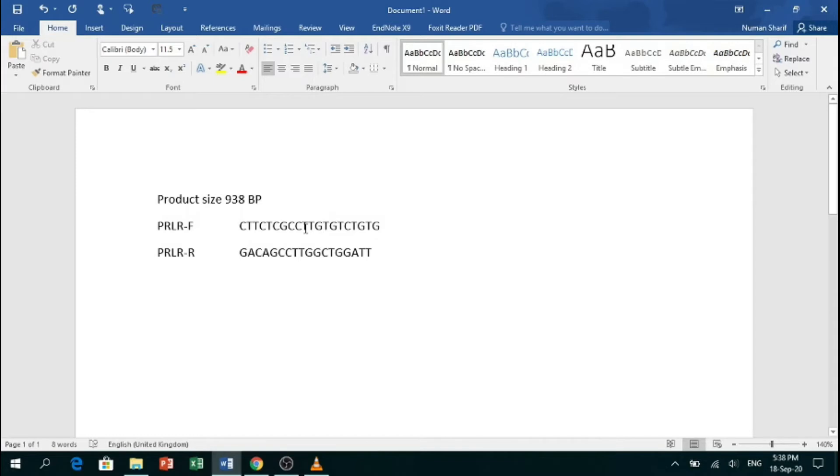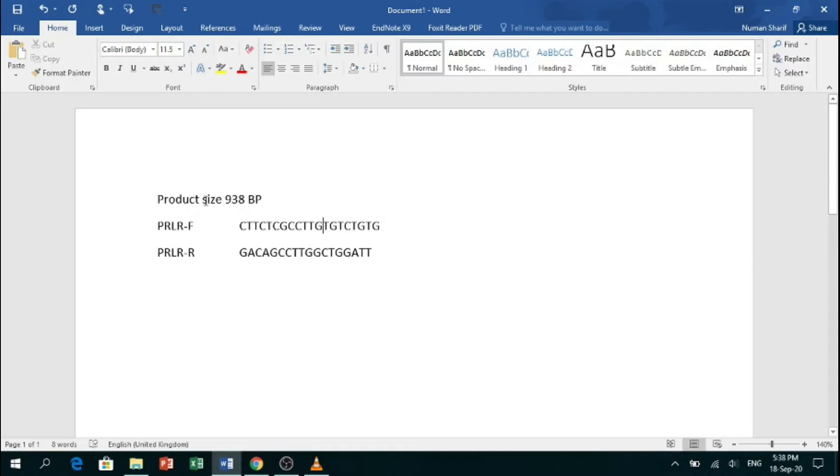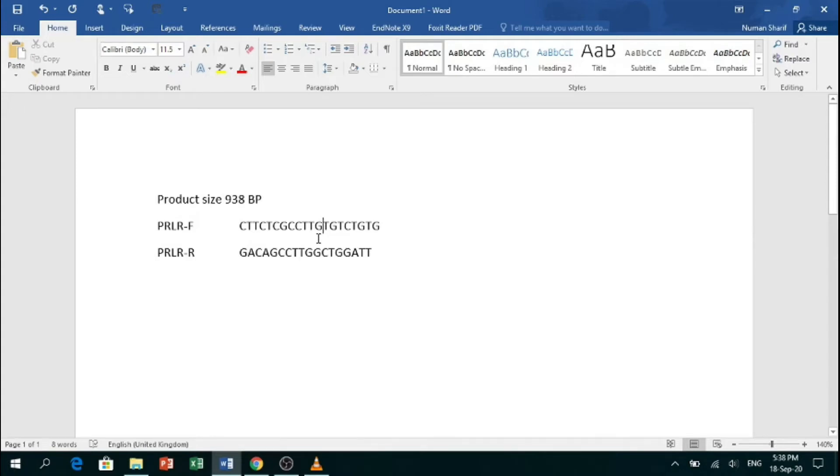There are different tools to design primers, but the tool I mostly prefer is Primer3 Plus. I have already designed these primers for the prolactin receptor gene of sheep by Primer3 Plus for a 938 base pair DNA region.